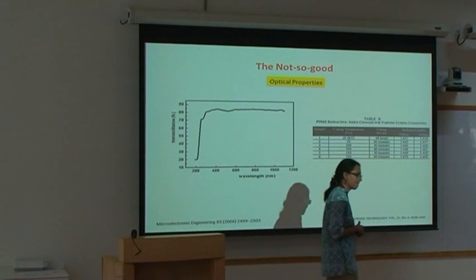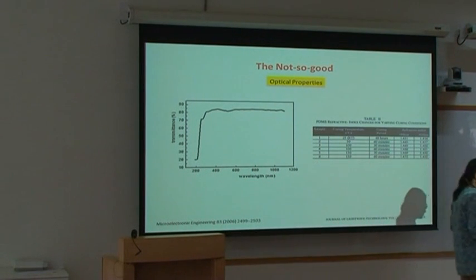Sorry, Bidisha, how thin can you make it? That will depend on the percentage weight of the polymer. Yes. So if in your application you can work with 100 micron thin PDMS, you can easily stretch it to 50%, 60%. I don't know if you can work with 50 micron.